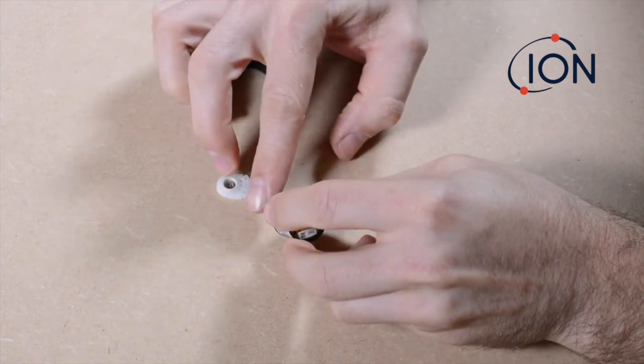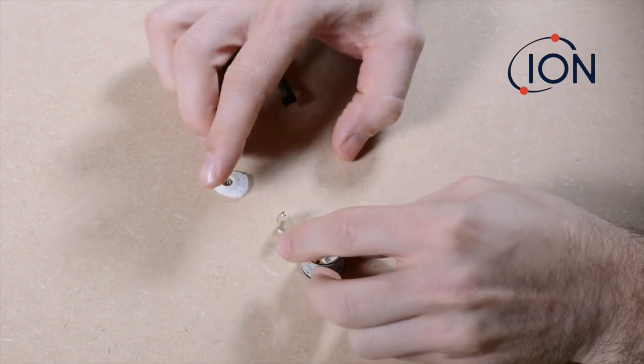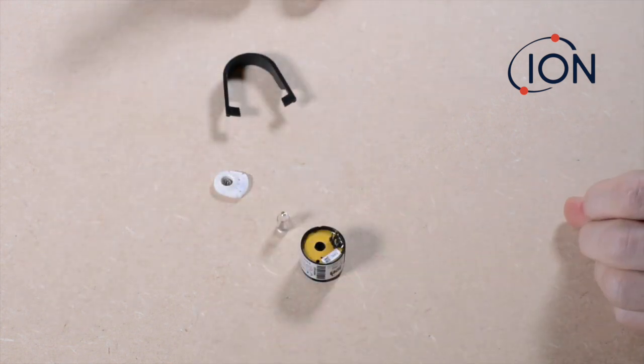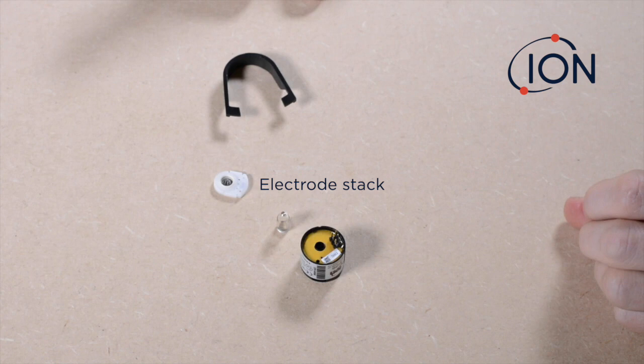You should now be able to easily remove the electrode stack and separate the mini-PID into its three components: the electrode stack, the lamp, and mini-PID body. Within the mini-PID body there is also a spring that will occasionally come loose.